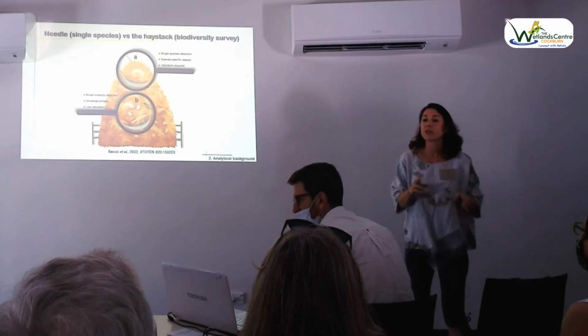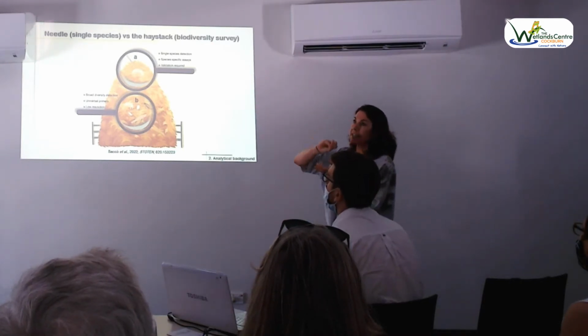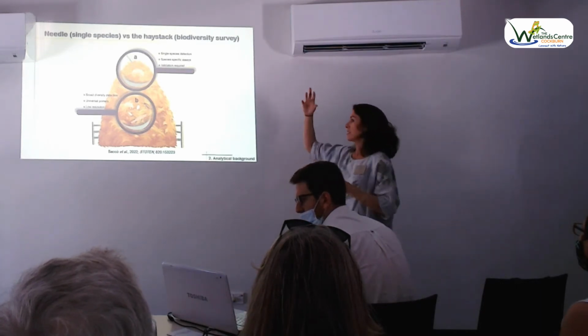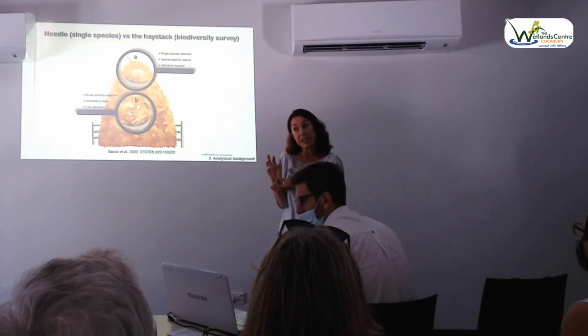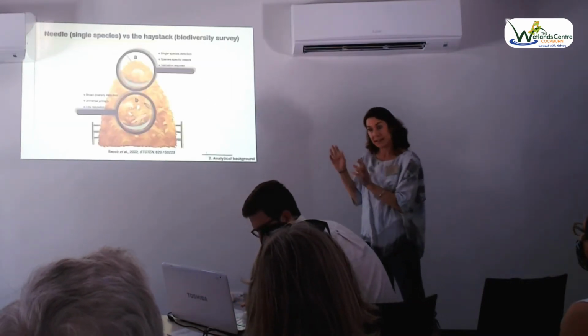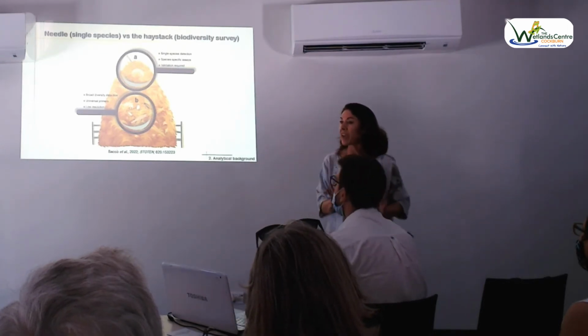This is what we call looking for the needle, because remember that invasive species DNA is going to be in that mixed sample. There's also going to be fish and crustaceans and marine microorganisms, all of that in that mixed sample. But in that mixed sample, we're asking, is the invasive species DNA present in it? This is where we call the needle or the haystack.